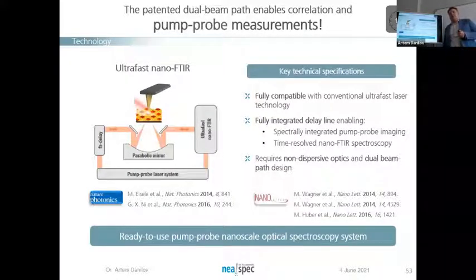So in that case, you explain it with a couple of dipoles and stuff. Yeah, you can actually do it the other way around. You can illuminate from the top and then collect from the bottom, and then you can be sure that this is in-plane polarization. But okay, why not magnetic field?